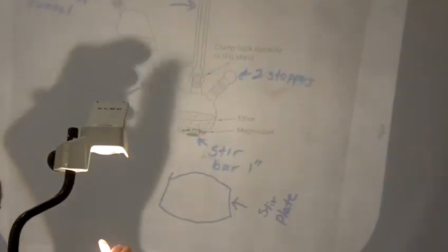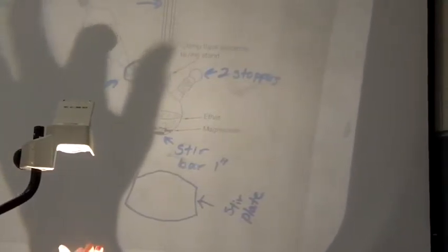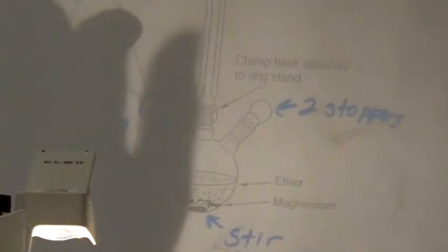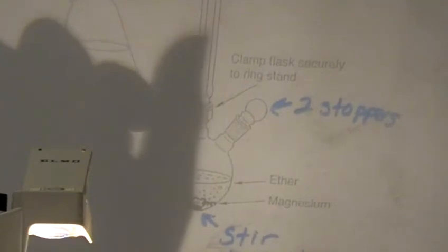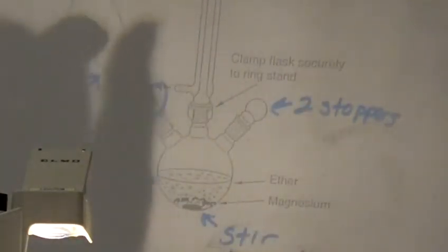And so what you're going to do, an easy way to make up that solution without having to then get like an Erlenmeyer flask out and stir it and have it introduced to water and air and so on and so forth, is put your ether in your sep funnel first, okay? And make sure your stopcock is closed, all right? Then if you pour your alkyl bromide, which is more dense than the ether, it's going to pass through the ether into the bottom of the sep funnel, and that'll get it mixed fairly decently, okay?